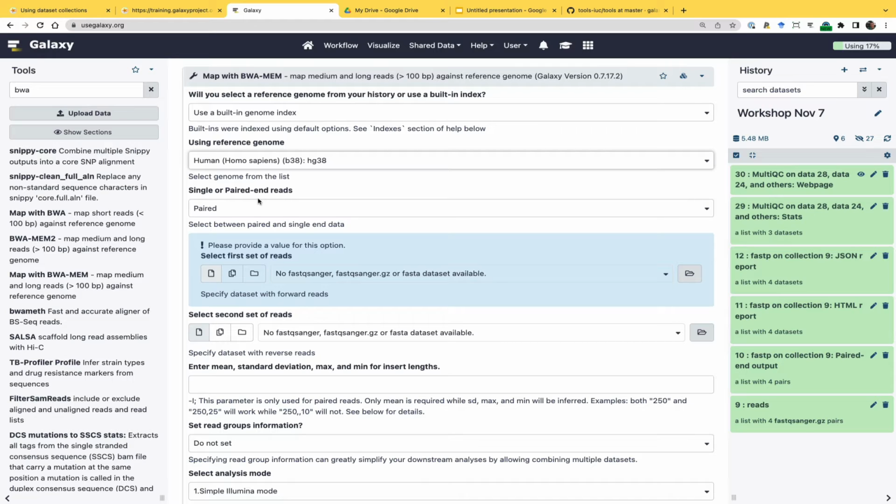This is not the latest version of the human genome, but it's the latest, most annotated version of the human genome. The newest version of the human genome is called the T2T human genome, telomere to telomere, and it's not as heavily used yet because it's not annotated well. So it doesn't have all the tracks with all the genes, expression data, regulation data, and so on yet. So hg38 is the most annotated version.